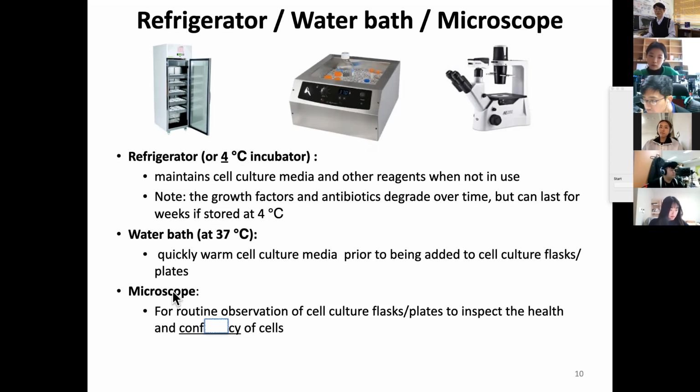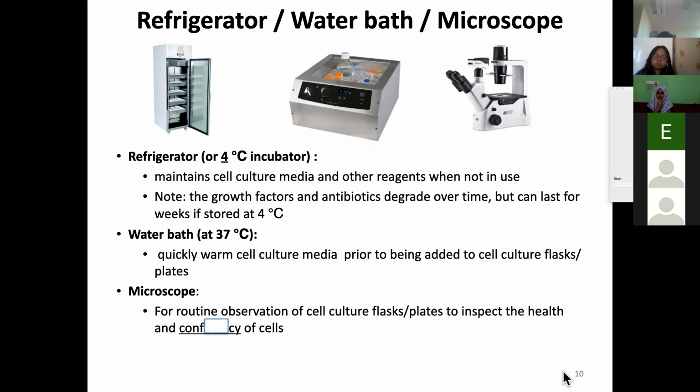And the microscope is what you have to watch with your eye. It is for routine observation of cell culture flasks and plates to inspect the health and the amount of cells growing on the cell culture flask. Okay, that's called, let me see.